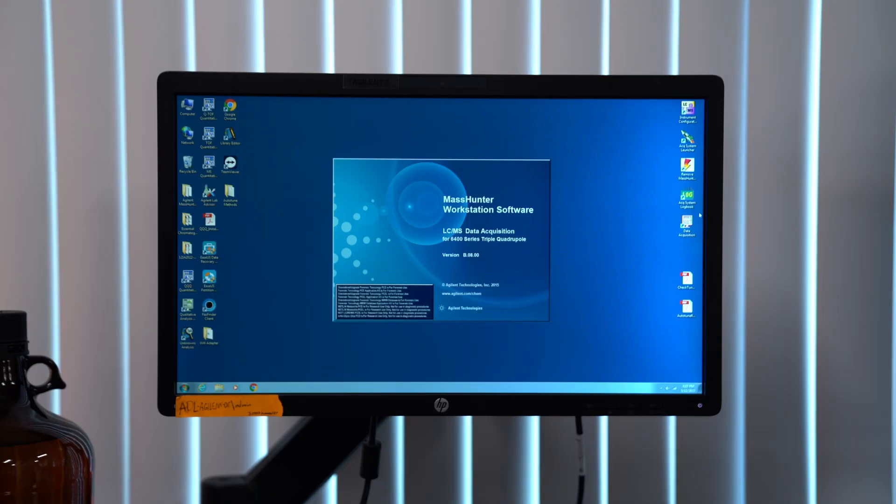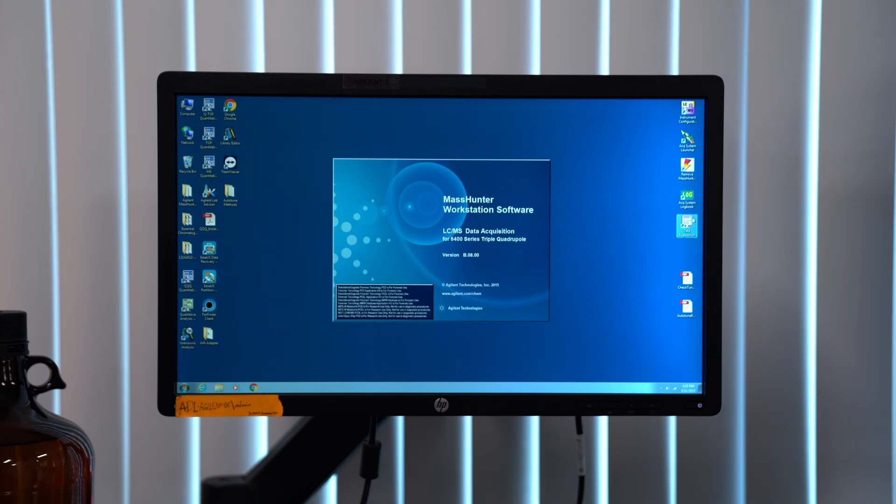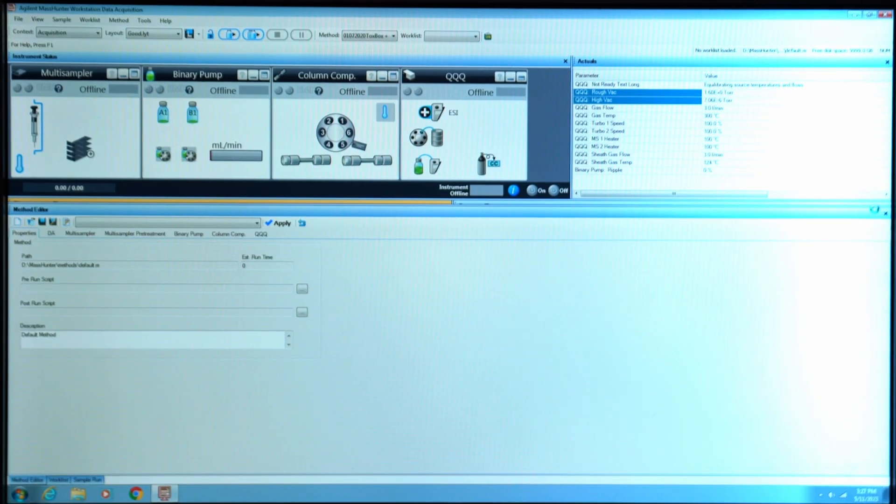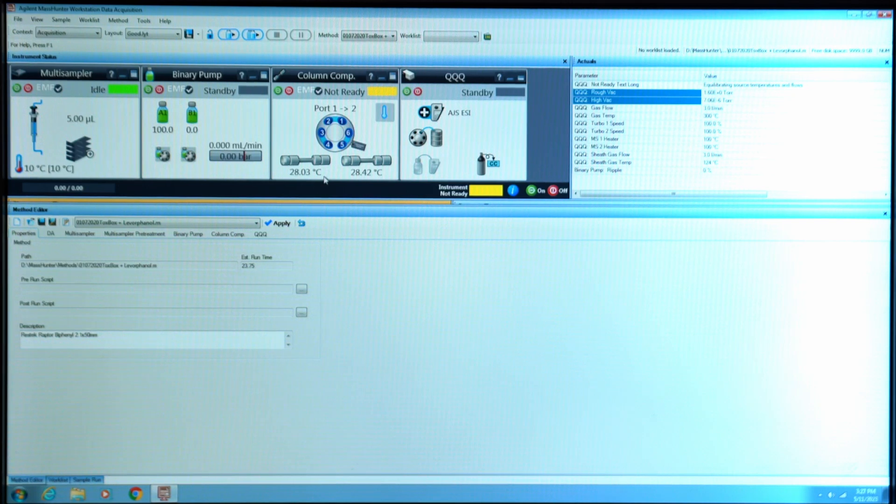I'm going to show you how to purge the pumps on this Agilent mass spec. The first thing you'll want to click is the data acquisition button to open up the software where the purging happens.